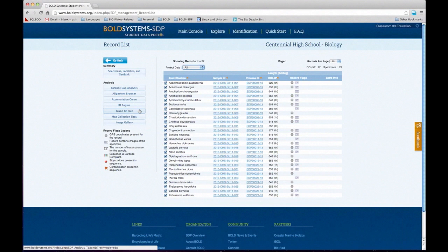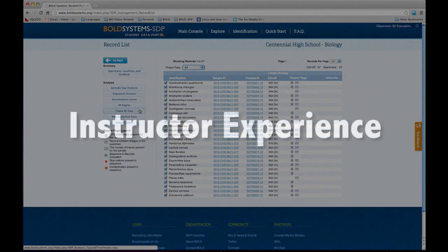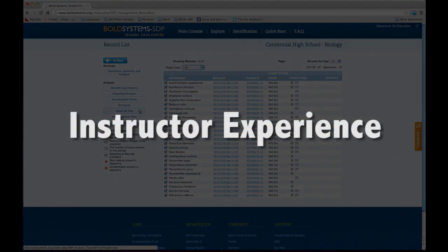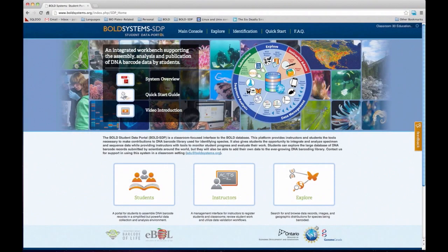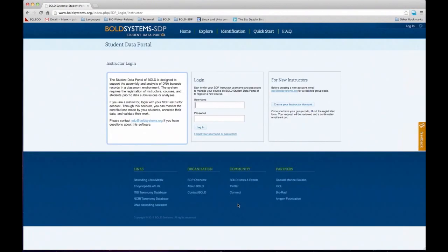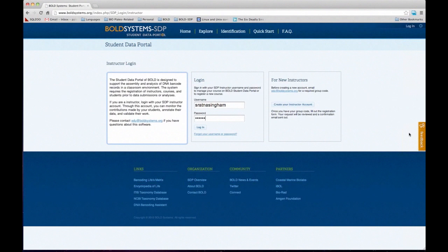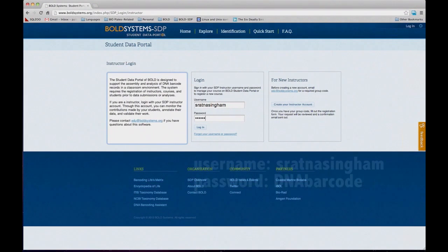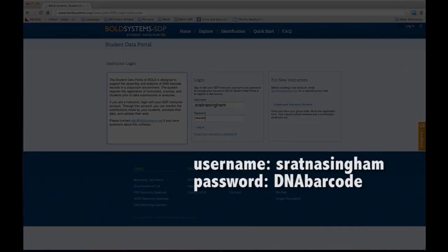Moving on, I believe we can go to the instructor experience now. I'm going to log in as an instructor and show you what that looks like. The login information is sretnazing and the password is dnabarcode. I'll include that in the chat. Feel free to use this account — again, this is a testing account.